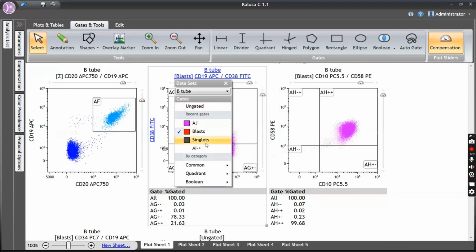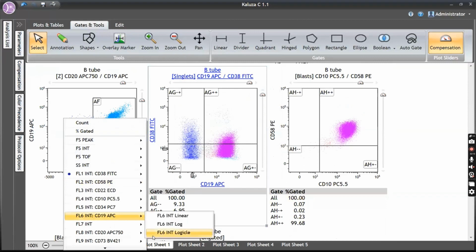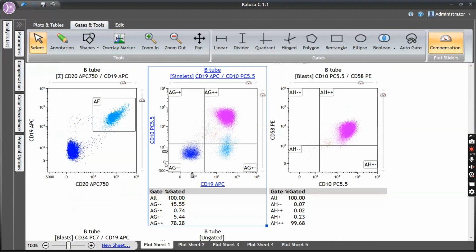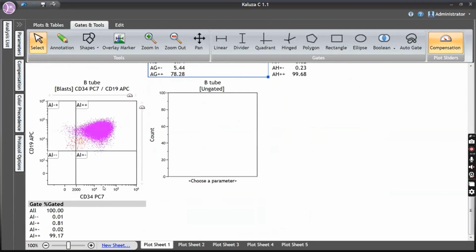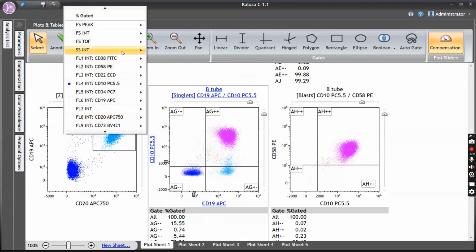Yeah, CD19 we checked. Almost the same as normal B cells. Okay. So CD19 is moderate positive. CD10 is moderate to bright positive. CD20 is negative predominantly, except in a subset where it is expressed in a dim fashion. Okay. CD34 is positive in a moderate fashion. And CD58 is moderate. What else? CD38 is negative.